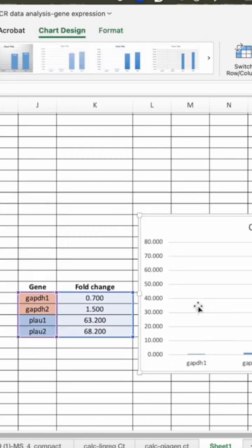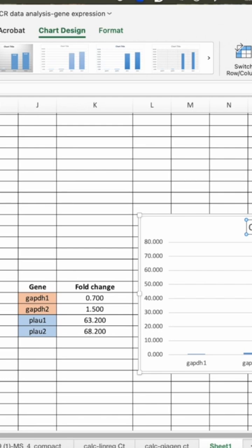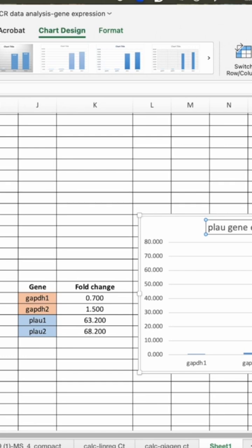So you can just now change the graphs as per your interest. You can change the color. You can change the level here. So I'll just change the chart title. You can write it graph here.